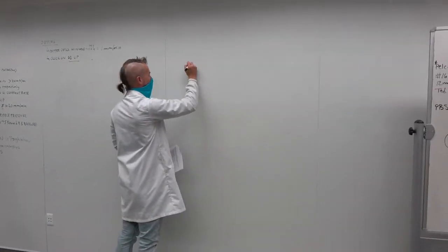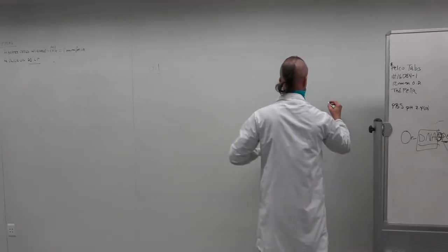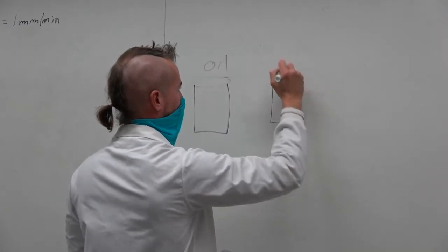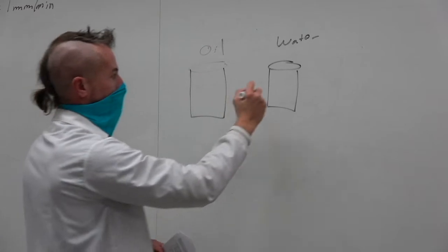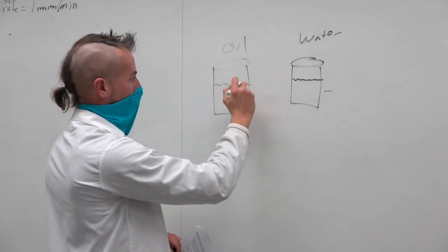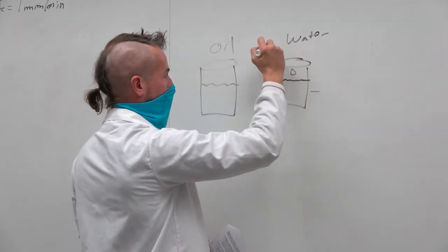We have our oil, and water, and we're generally going to have more of the water phase. For both situations, we're going to take some of this and basically drip it in.